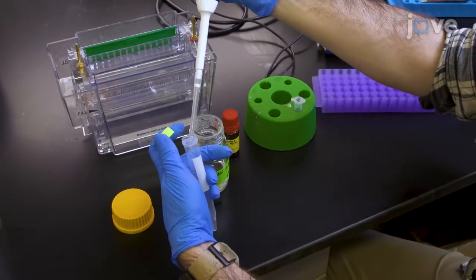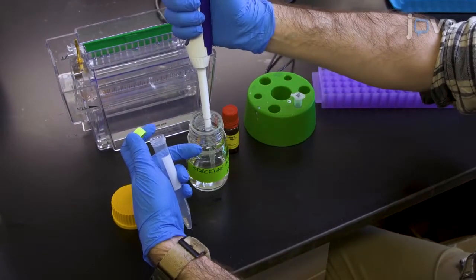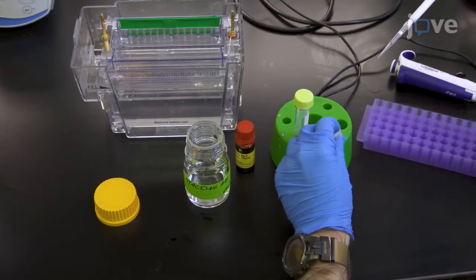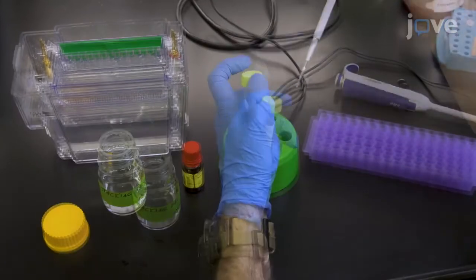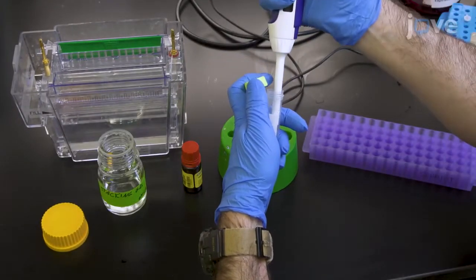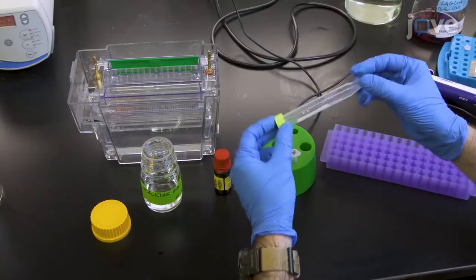Cast the stacking gel by mixing 3 milliliters of stacking gel solution with 90 microliters of freshly prepared 10% ammonium per sulfate in a 15 milliliter tube. Then add 3 microliters of T-Med and invert the tube gently 2 to 3 times.